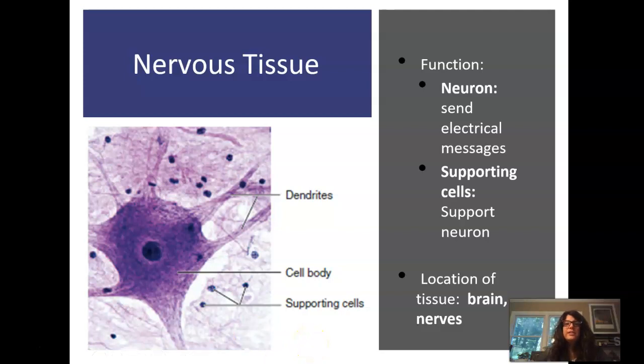So those are the different categories of tissues, and examples in each category. You are responsible for being able to identify pictures and/or identify them underneath the microscope. So make sure that you're drawing them with as much detail as you can in order to have this to study from throughout the week.